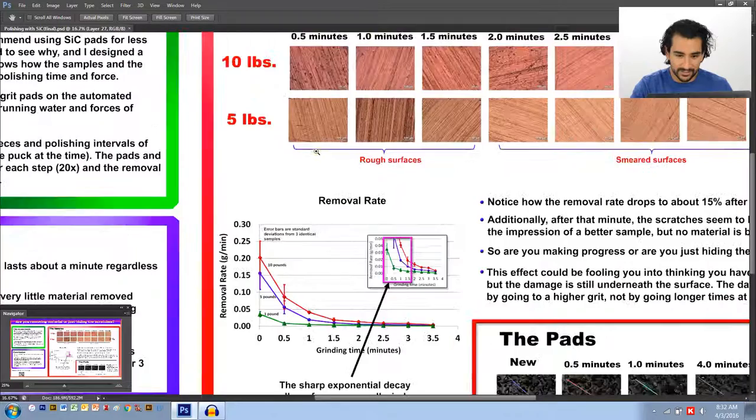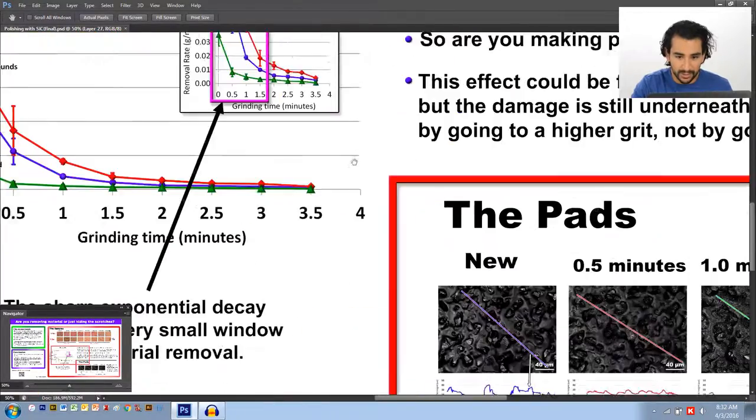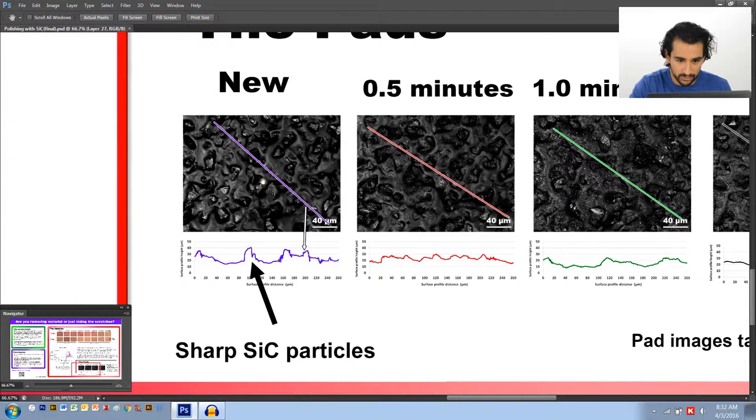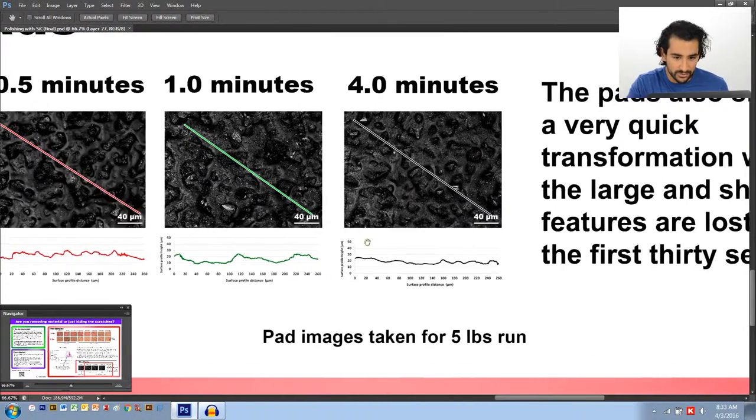Now, the other thing I did was I took pictures of the pads to try and understand what was going on in the pads. And when I took 3D pictures like this and I looked at the 2D profiles, I noticed there's, at the beginning when they're new, there's this big, sharp, silicon carbide particles. Those are the useful ones. Those are the ones that we want to be, that we hope to have for as long as we can. But you see very quickly within the first 30 seconds, they're gone. And that, if you think about it, that shouldn't be very surprising because after all, they're just attached to a piece of paper. Of course, they're going to fall off. And then they just get washed away by the water and there's no more work being done.